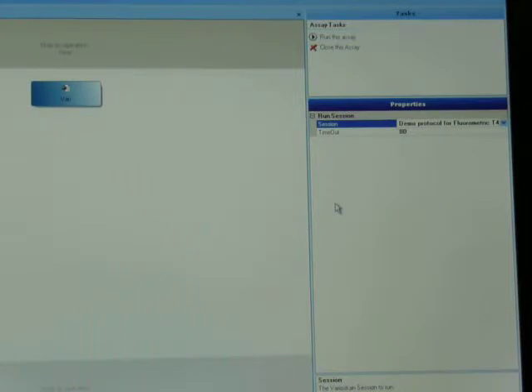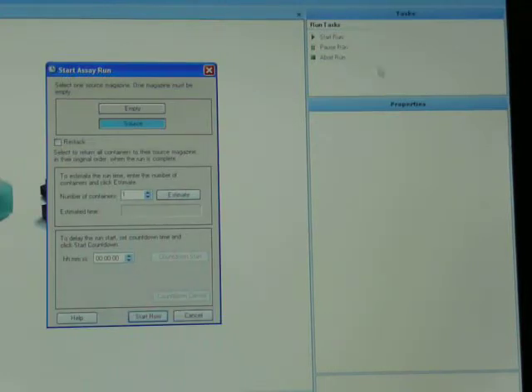To start this assay, all I have to do is click run this assay at the top of the screen.